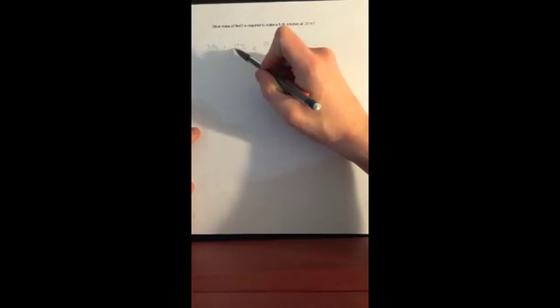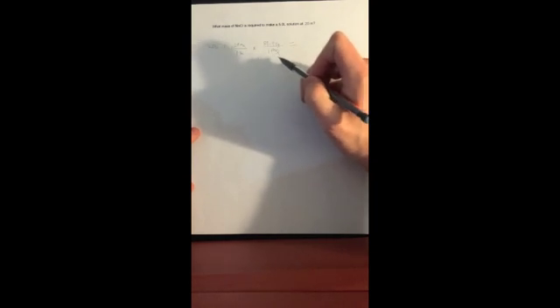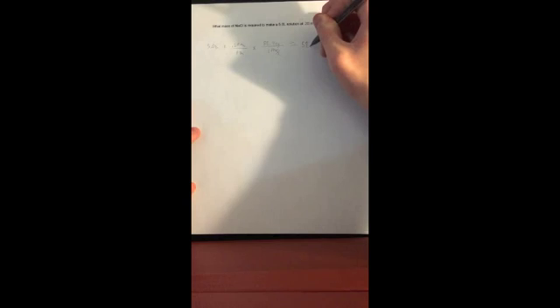So we want to write the 0.2 here and the grams here so that our moles per liter cancel out here. And once we do all the math, we are left with 58.44 grams. Now we're going to create a standard solution from a liquid.